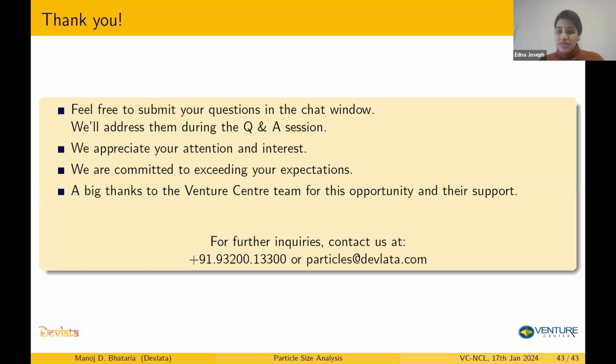The next query is from Dipti, and she is asking how to know which solvent to use for dispersing the samples. So basically, I think she wants to know how to choose the right solvent to disperse the samples for DLS measurements. For DLS measurement, your sample should not, first of all, be interacting with the liquid at all. So whatever solvent you are choosing, if it's going to react with your sample, that's absolutely no.